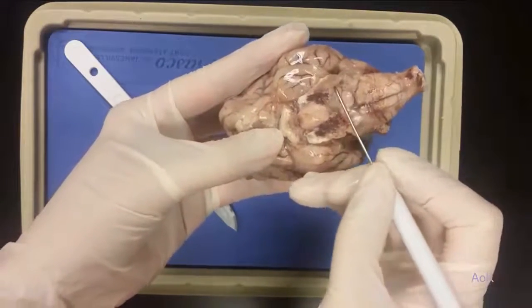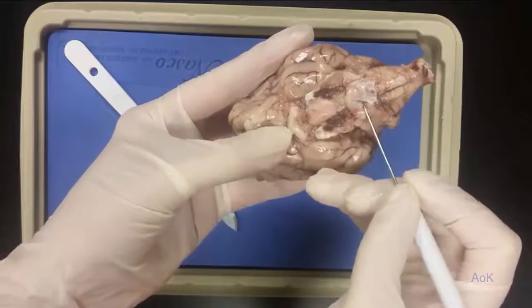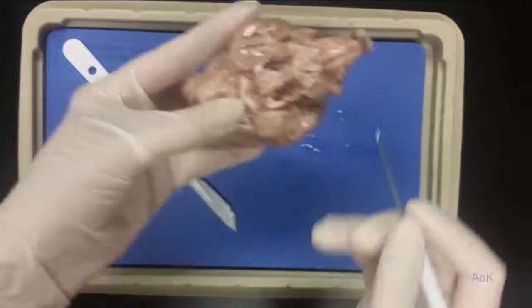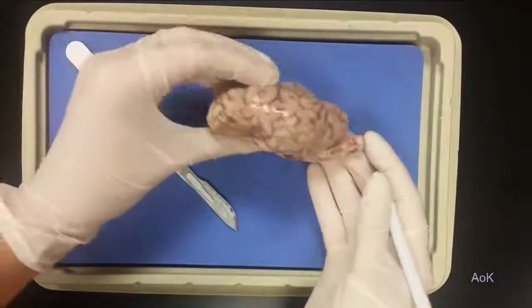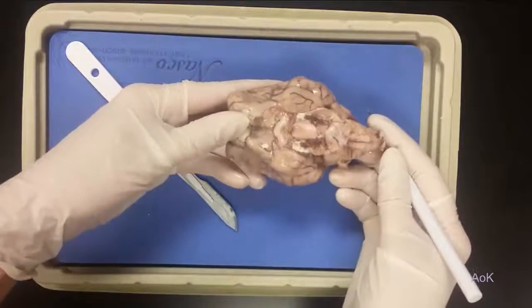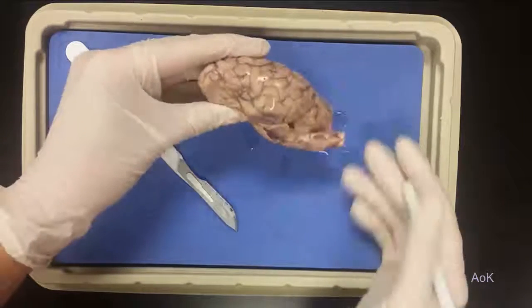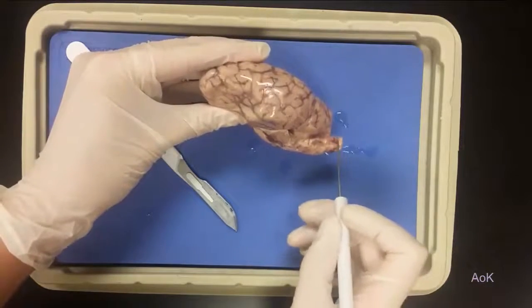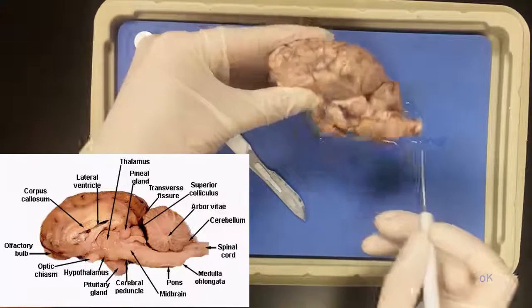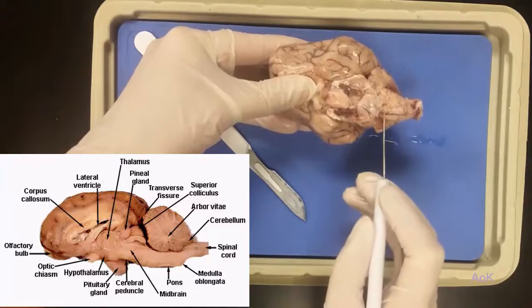So these little flaps that look kind of like skin are the connective tissue that makes up the meninges. Here we have a dorsal view of the brain, and this is the ventral view. You can find the spinal cord at the very bottom of the brain, and directly above it is the brainstem. So that includes the medulla and the pons.